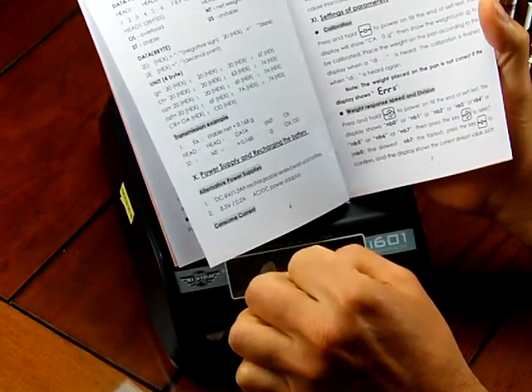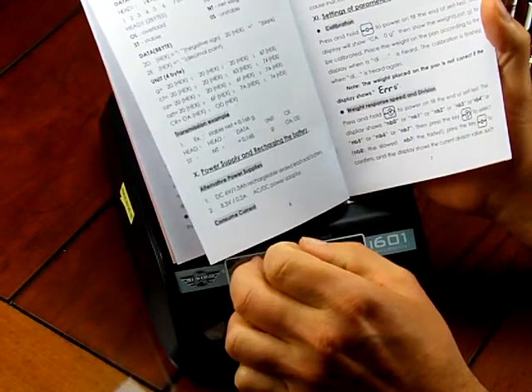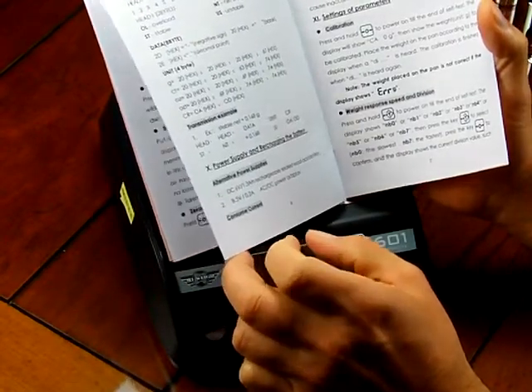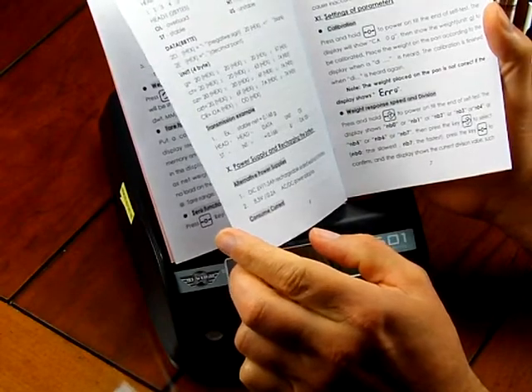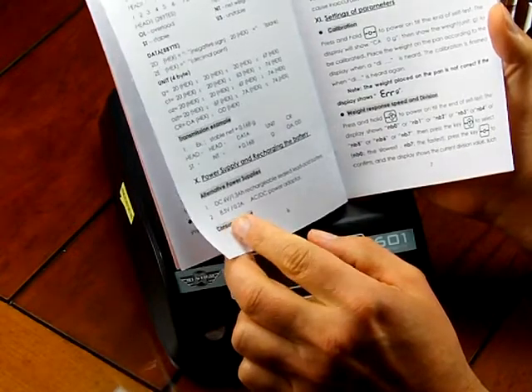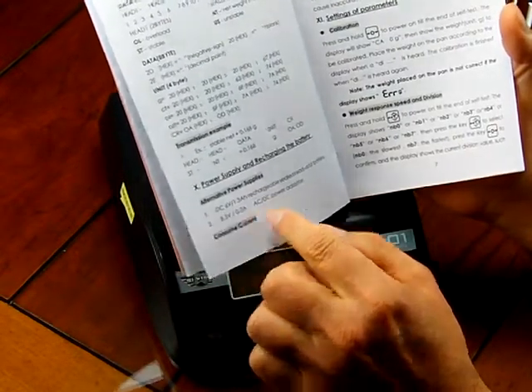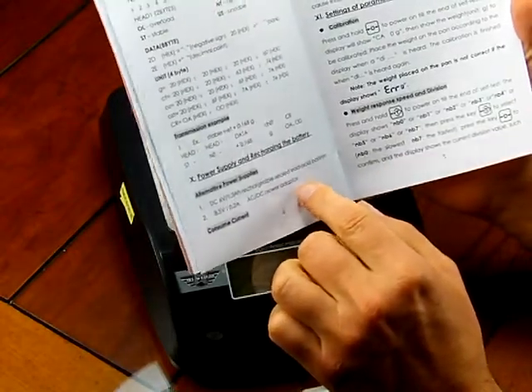we would recommend you look at the A&D EK series, comes standard with an RS-232. And A&D, which is a different manufacturer, offers WinWay software that you can download from the manufacturer's website. But the A&D has more money, and the MyWay is a great affordable scale for people on a limited budget.